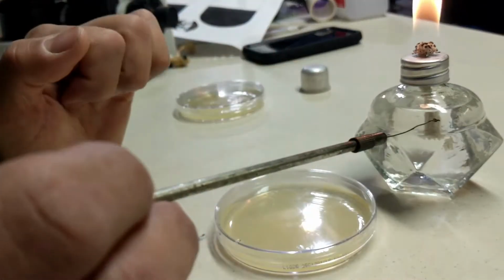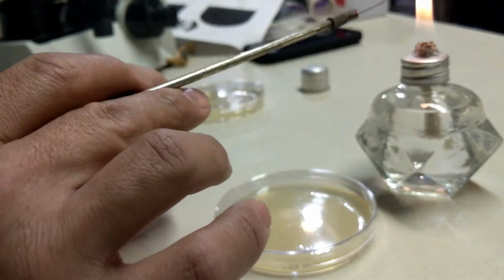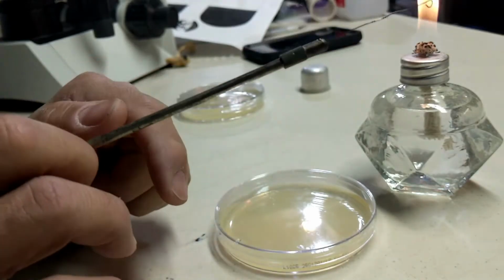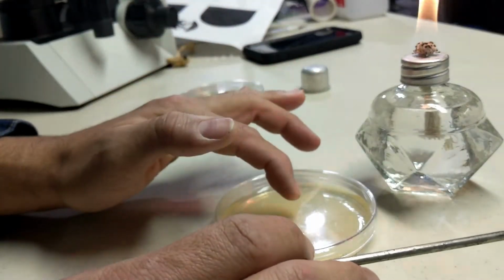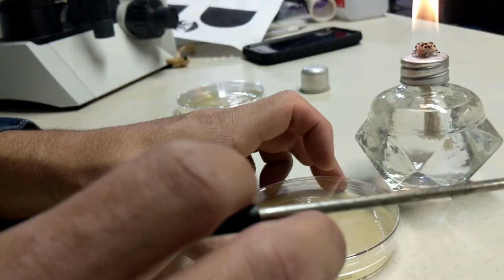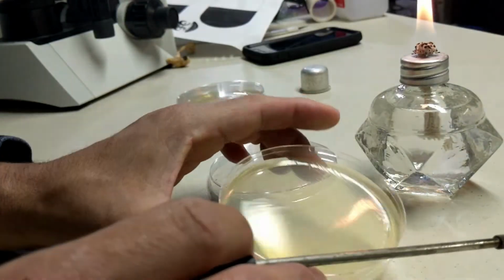After that, you close it. Then you need to sterilize your inoculation loop. And after it is sterile, then you're done with the first quadrant. Now for the second quadrant, let me just show you. I'm going to open it just for the example.